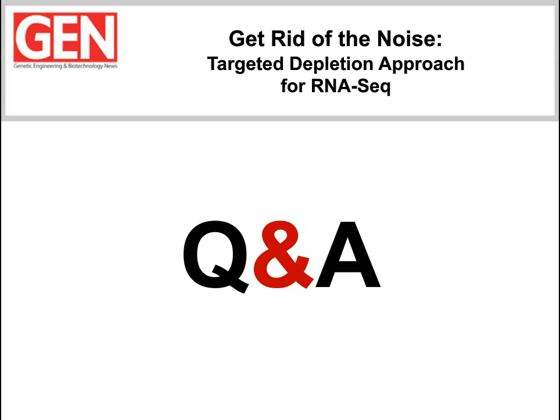If any users have more specific questions about compatibility or more details about the ratios that Solo can be pooled with non-Solo libraries, again, you can contact our tech support and they'll be happy to help you.